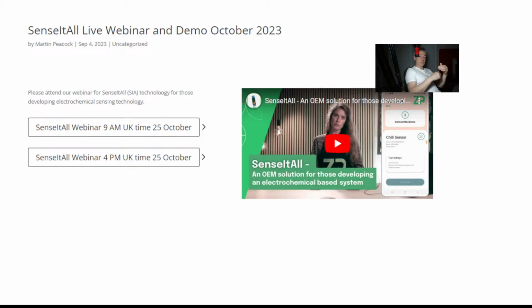Then I noticed there was a duplication of that data. I don't know why it's in that file, but I deleted the second copy, saved it, and uploaded the text file. I told the Djuli database this was amperometry, and it was able to display it. Because it is so noisy, I put a smooth on it as well, a moving average with a window of 25, to smooth it out. But of course, I'm just showing you here that it's capable of this.